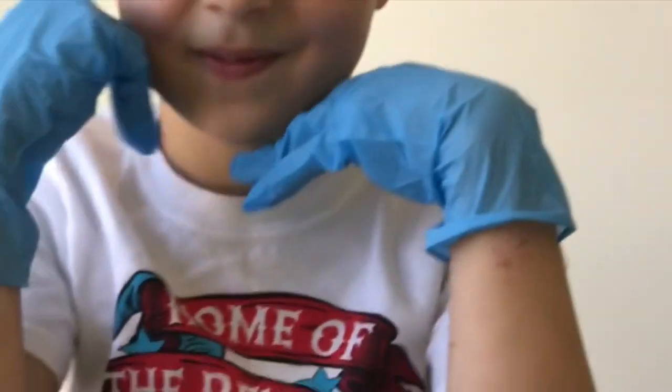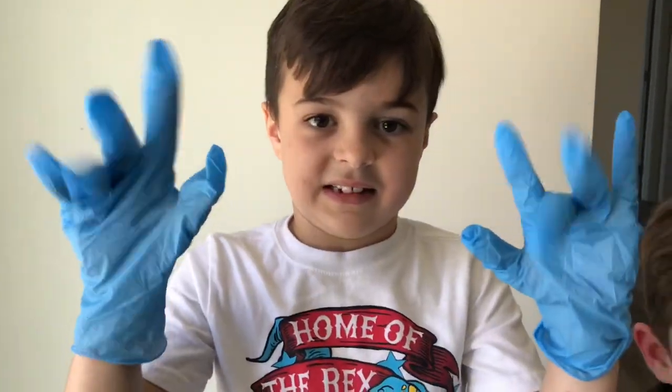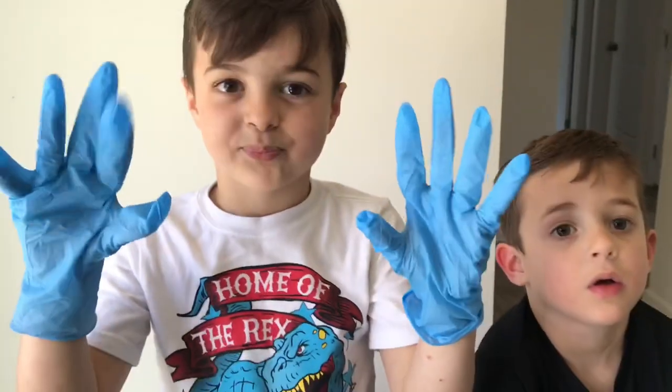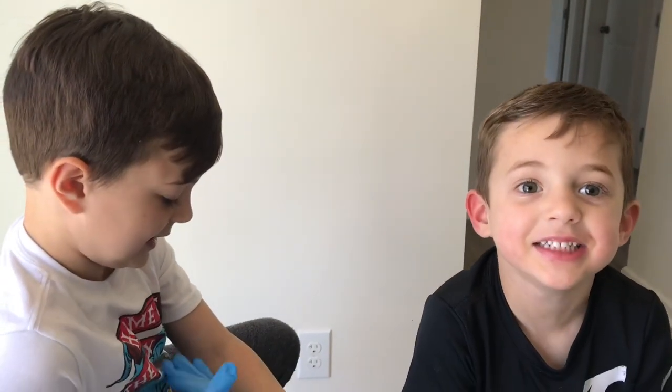We're back after six days. We're putting gloves on before we touch the bacteria, because we don't want to put the bacteria that we grew on your hands. So that's very important, right Tommy? Like Dustin, like Mommy, like Daddy. That's right. Open the box.